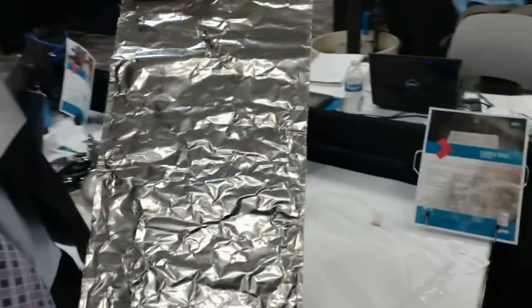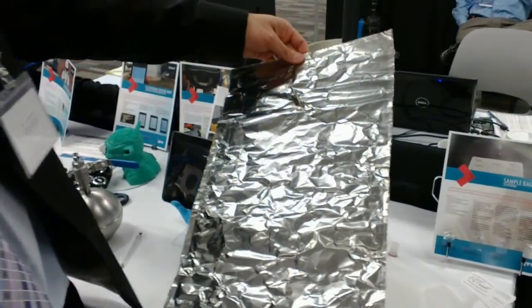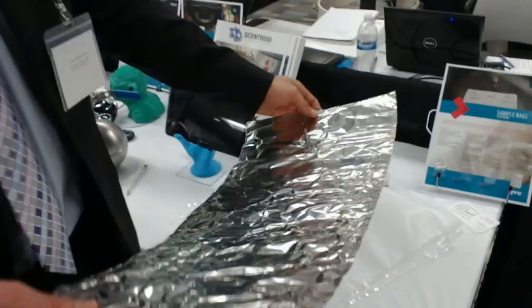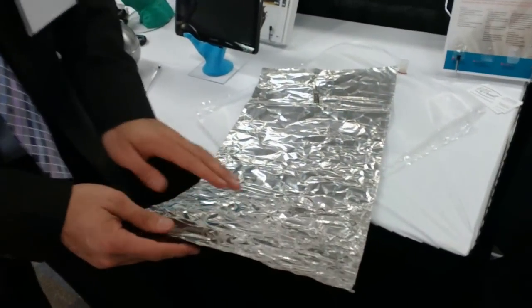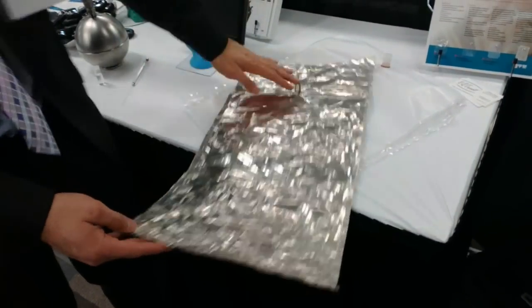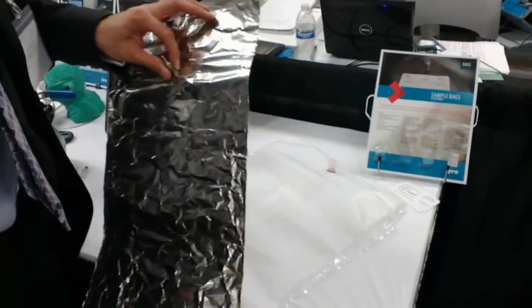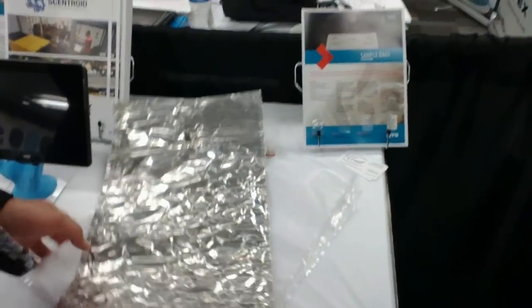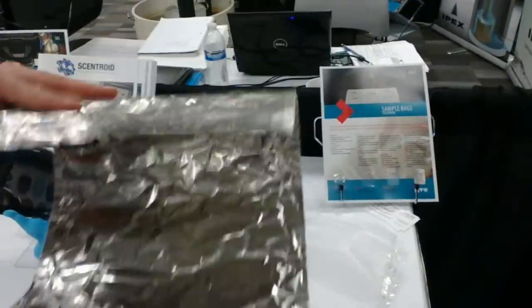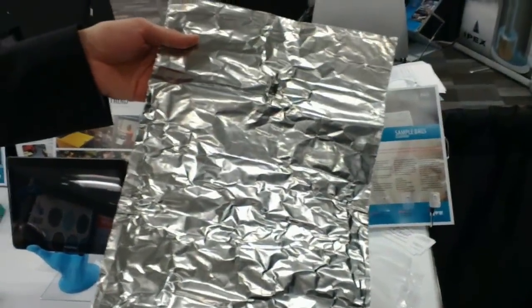We also make these ones — they're just welded around. The volume is about 15 liters. We have two types: ones that have a fold like a juice box that opens into a triangle when inflated. You can reuse this one forever — just put it in the oven at 400 degrees Celsius and it will be clean as the first day.